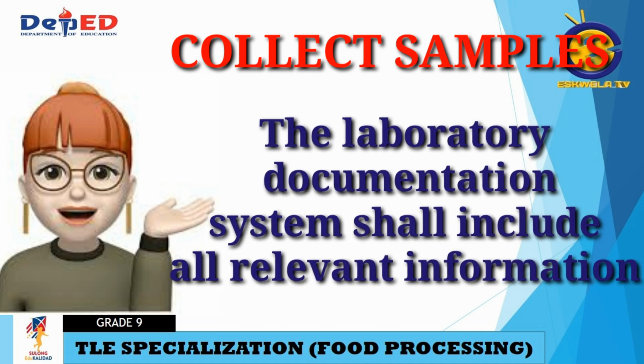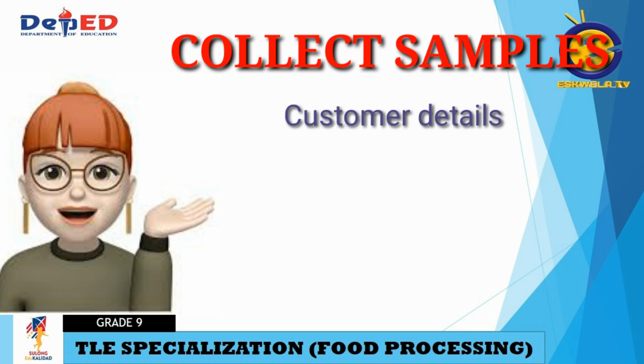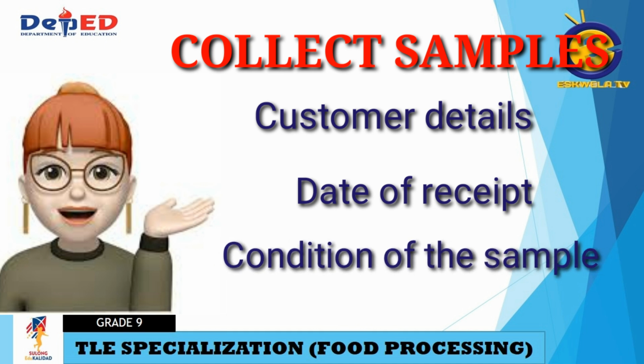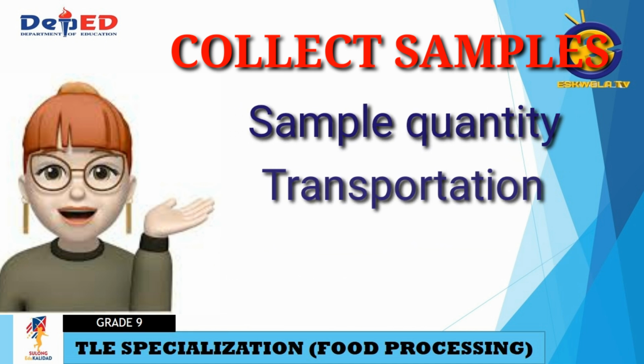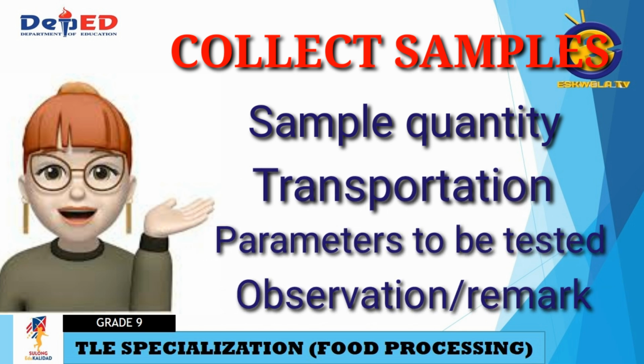The laboratory documentation system shall include all relevant information such as customer details, date of receipt, condition of the sample on receipt, sample quantity, transportation, parameters to be tested, and observation or remark.